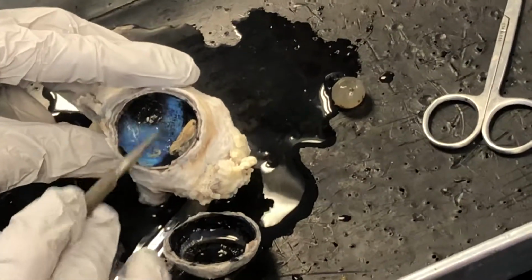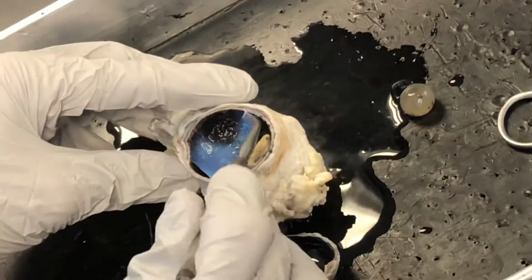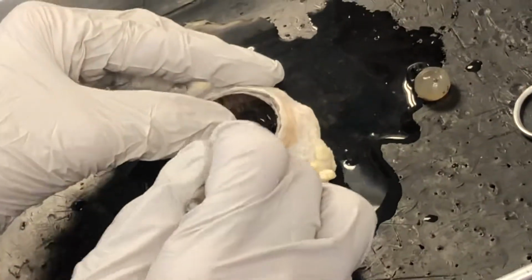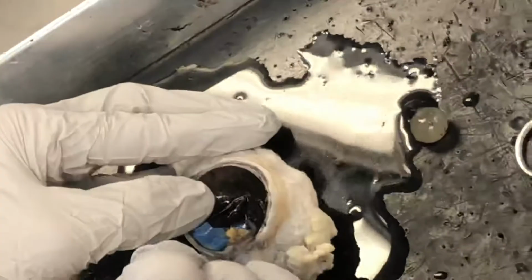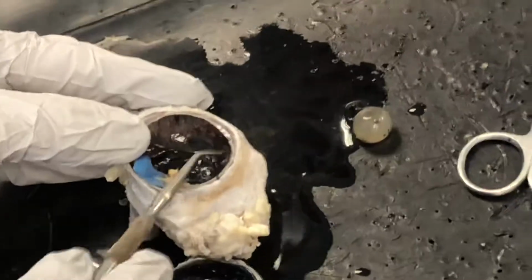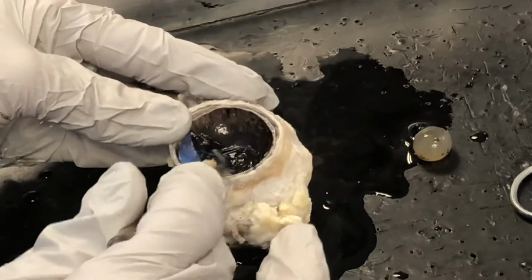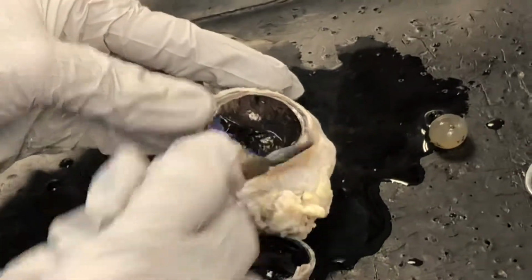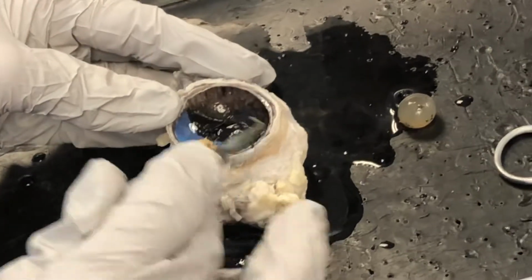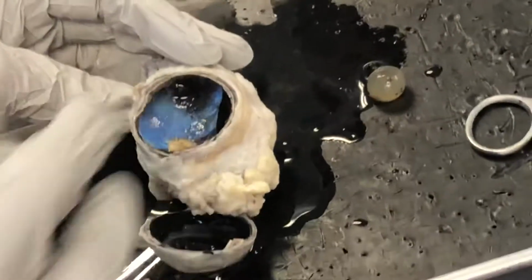So this would be the pigmented epithelium of the retina, black and blue. You peel that back, it does peel back. What's revealed would be the choroid layer of the eye right there. Actually, I'm sorry, I'm pulling the choroid layer with me. The black on the other side is the choroid layer. This is actually the sclera, the inside surface of the sclera there. The black is the choroid, shove that back in place, and now we're seeing the pigmented epithelium of the retina.